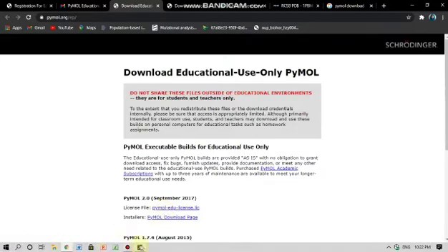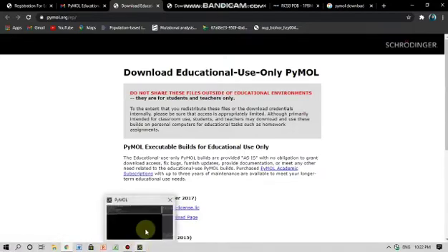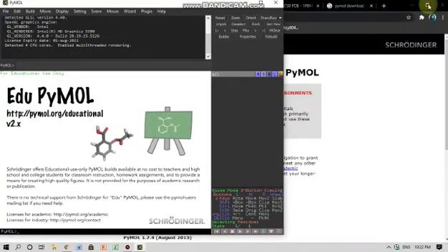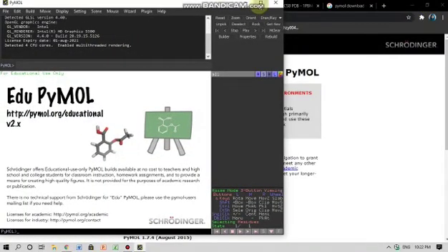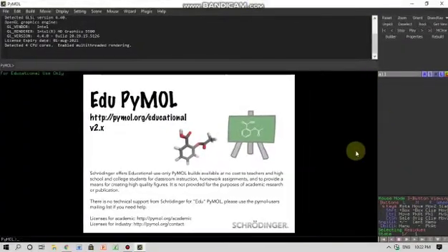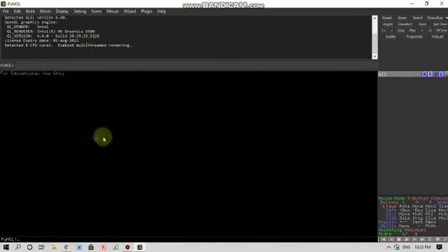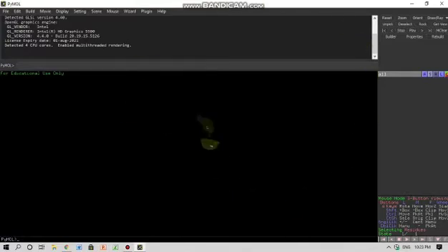After installation you will open up the software and such kind of interface will appear, with the exception that they will ask you to activate that license text file. After that you will get this kind of appearance of the software.